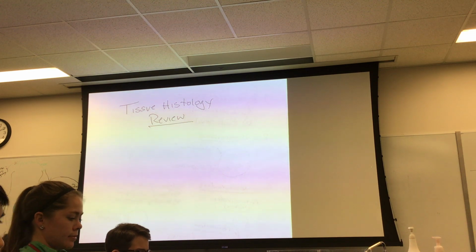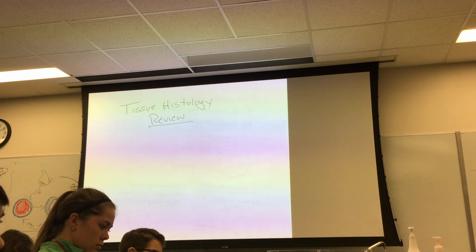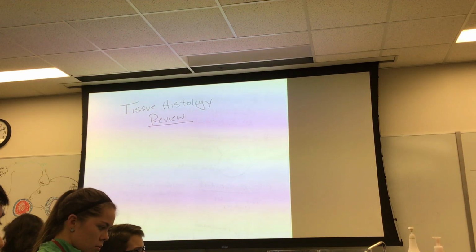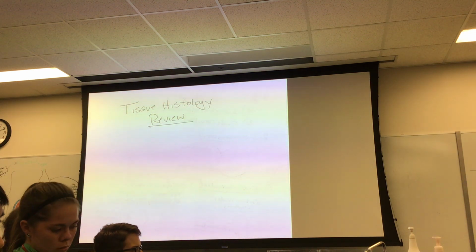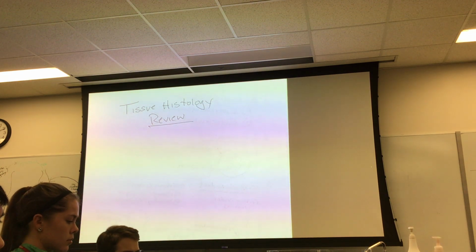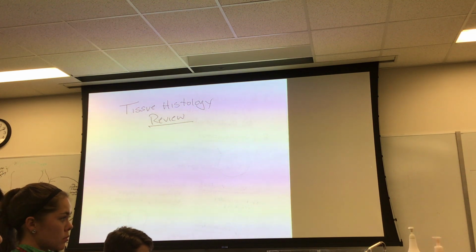So, today I'm going to approach this, and I gave some thought to how do you actually do a review? Well, you can't reteach everything, there's not enough time to do that, and I don't think you can benefit from it. So what I'm going to do is show you some classic, what we like to refer to as histo-lookalikes.